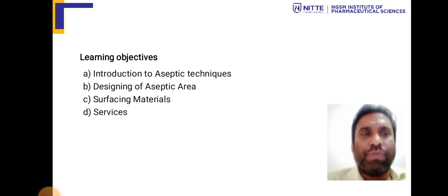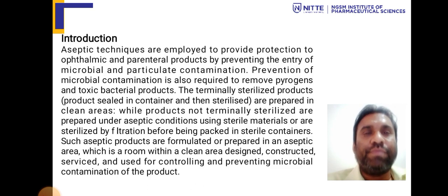Coming to the learning objectives, we are going to deal with introduction to aseptic area, designing of aseptic area, surfacing materials that are required, and services which are provided. So coming to the topic, introduction.